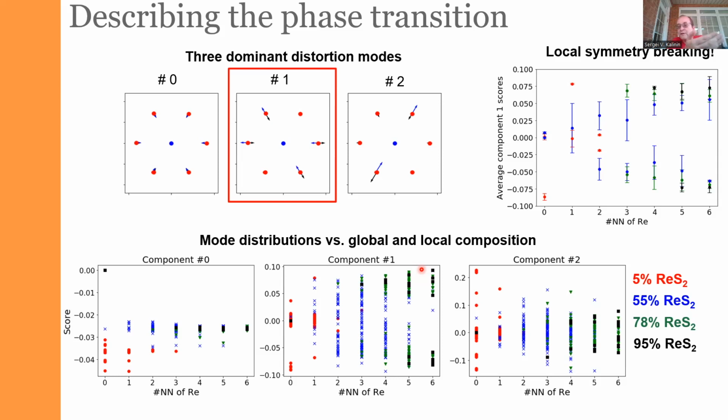Compare it to scattering, where the amount of material has to be quite significant. The smallest you can do is things like focused X-ray, but you still need several tens of nanometer volume of material to produce a measurable signal.